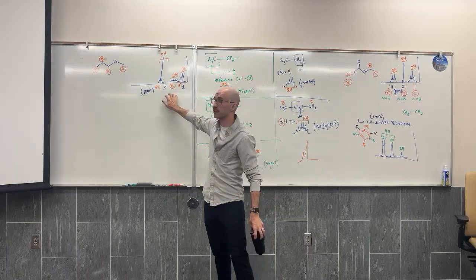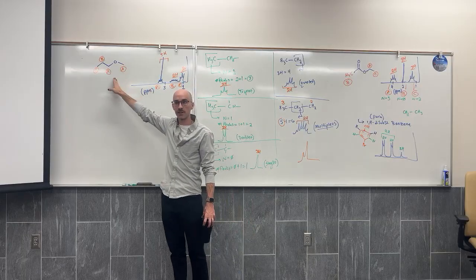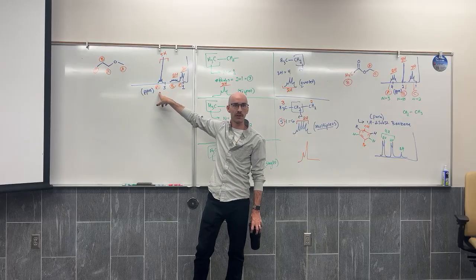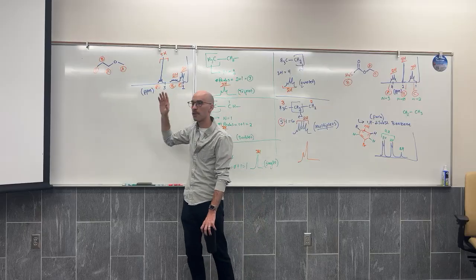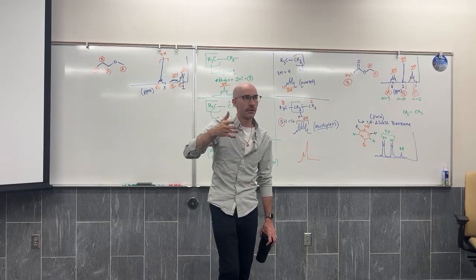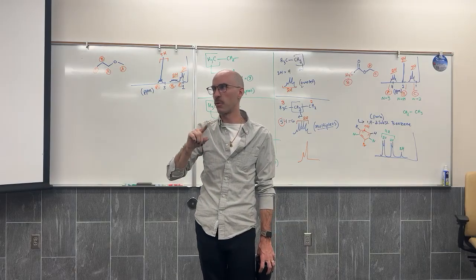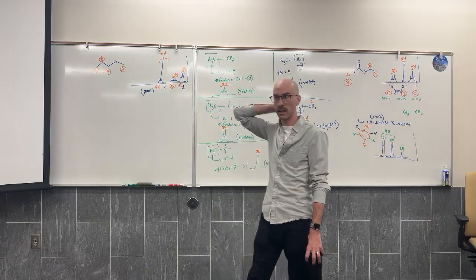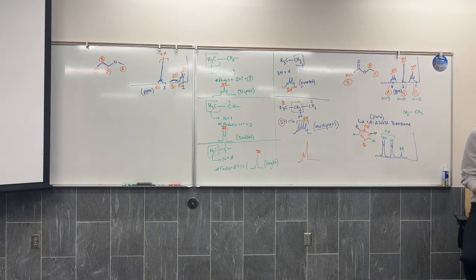When they have a spectrum like this, they actually label their signals from left to right, and then they assign them to the structure. They will actually go in and tell you that these are 2 different signals. They'll label it as A, B, C, D. And the distinction, they'll have like 3.11 is A, and 3.09 is B. So to the naked eye, you can't tell the difference between 3.11 and 3.09. But calculations and experimental evidence prove that they've got 2 different sets. Fun stuff, right? Crazy.